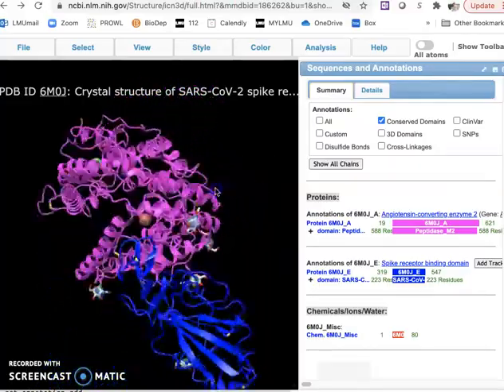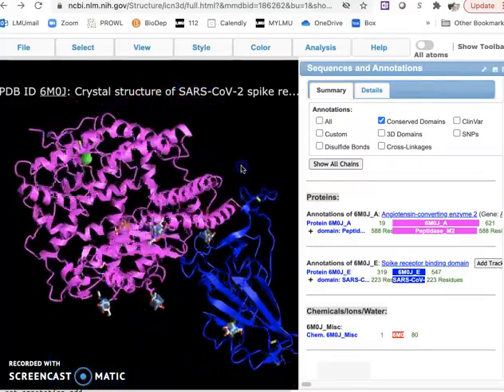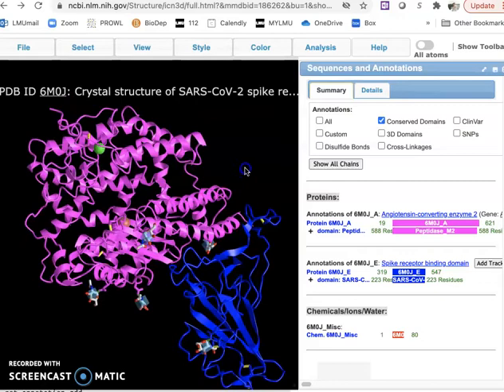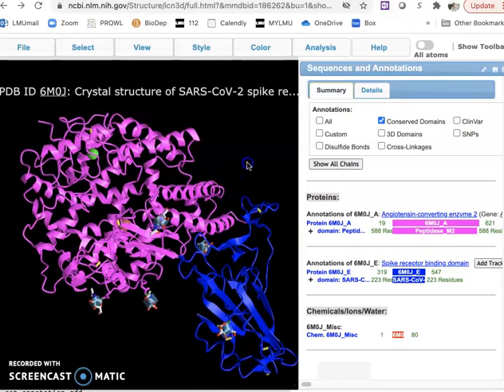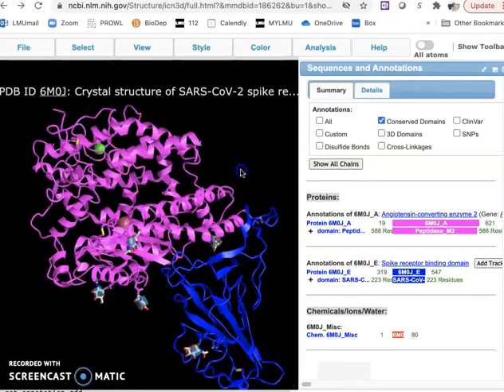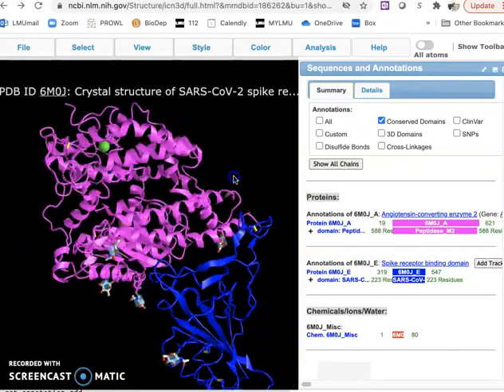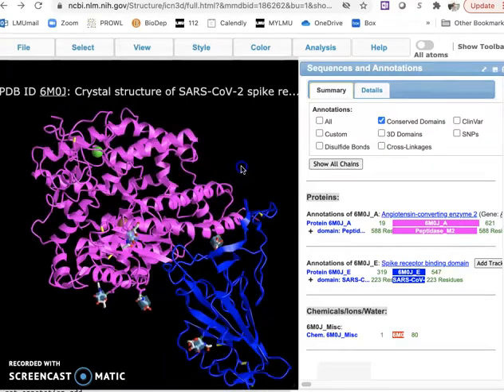We took a screenshot and then discussed what kind of structure it is. We came to the conclusion that it's a quaternary structure because it has two different proteins present on the same image.